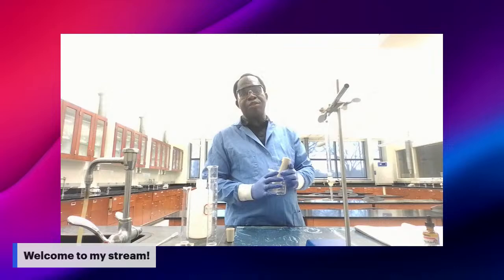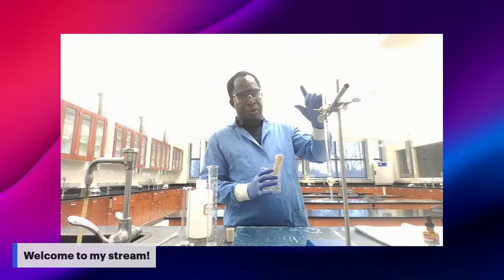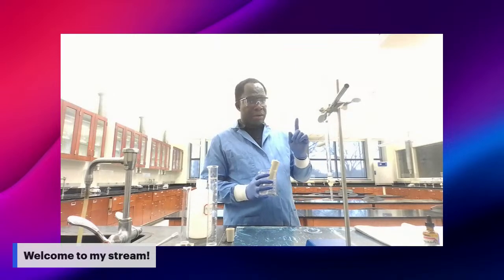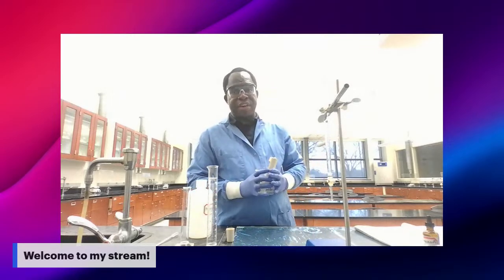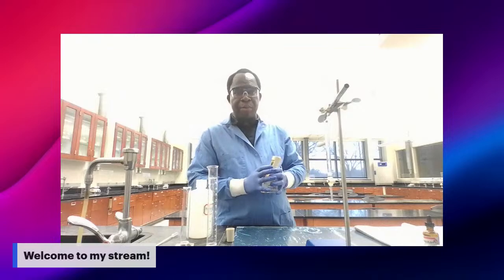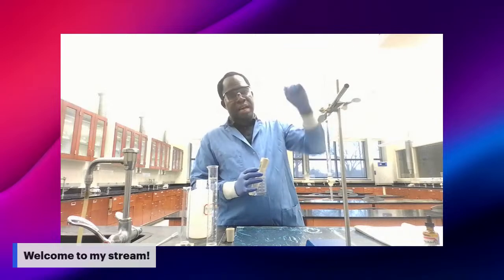Before you start adding the NaOH in increments of 1, do not forget that part. Measure the initial acid, the 25 milliliters of acid you have in the beaker. You need to measure the pH of that first, before you start adding.